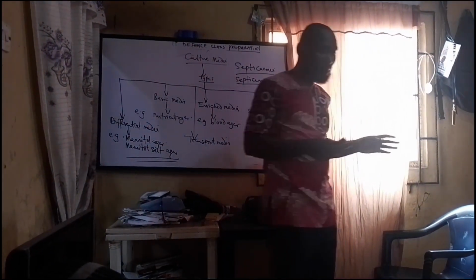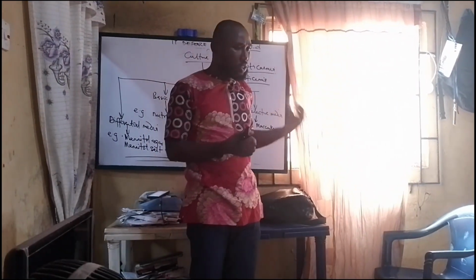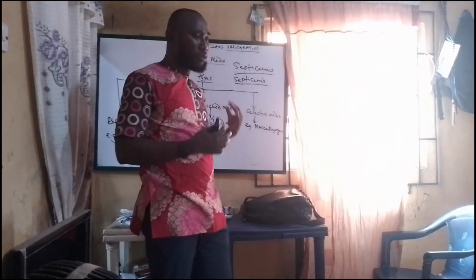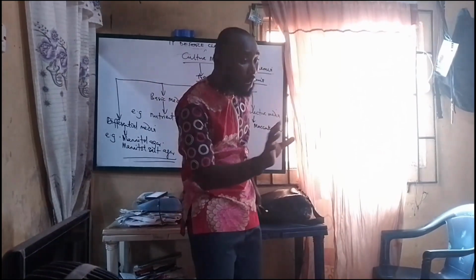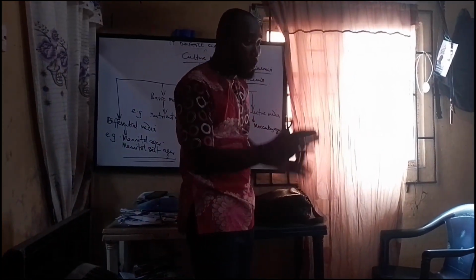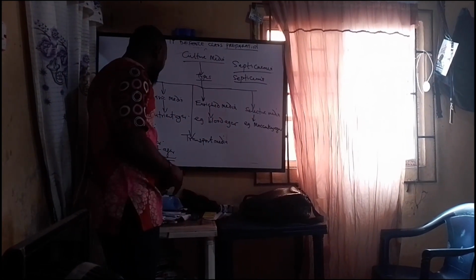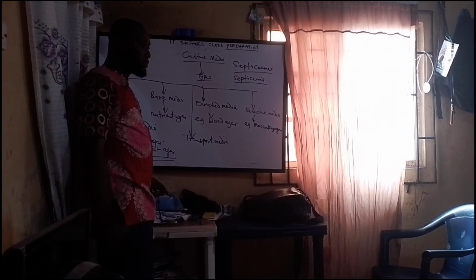What that simply connotes is that when you use this particular media, it will preserve a particular microorganism. In the course of transporting, the others will not grow, nothing will happen to that one. It will just be there. That's the work of transport media.